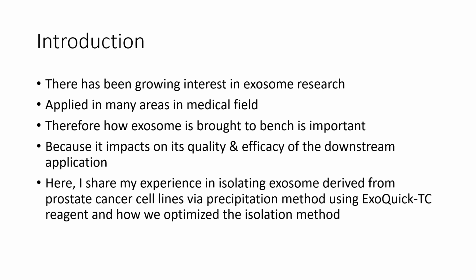Here, I share my experience in isolating exosomes derived from prostate cancer cell lines via precipitation method using ExoQuick-TC reagent and how we optimize the isolation method.